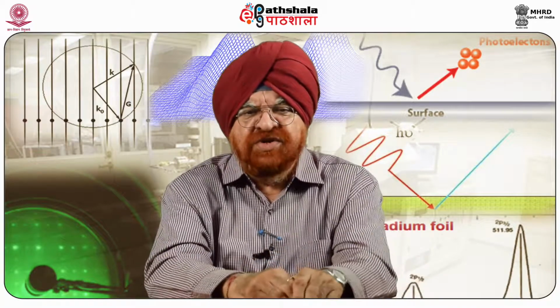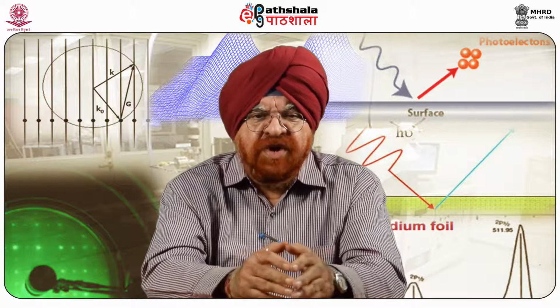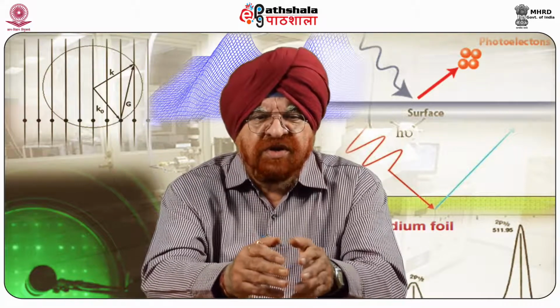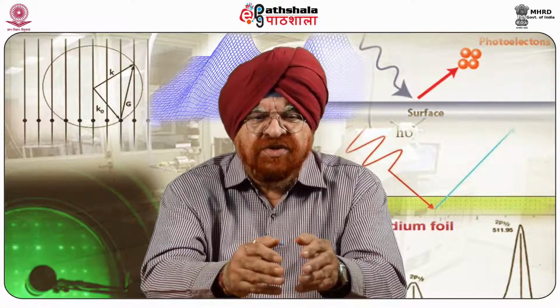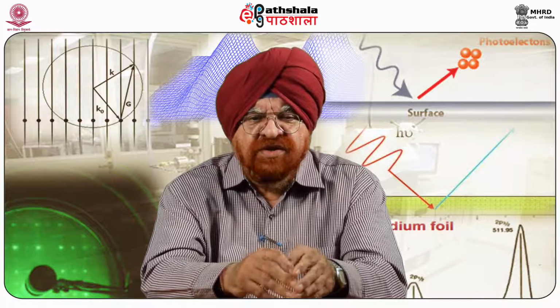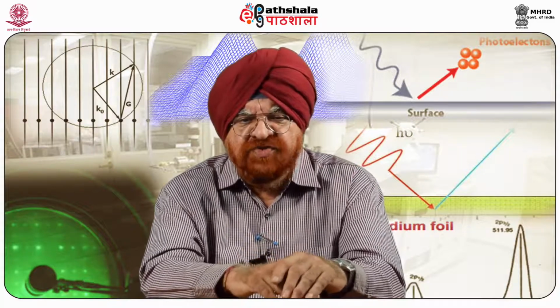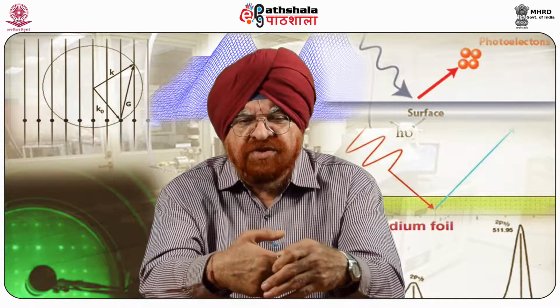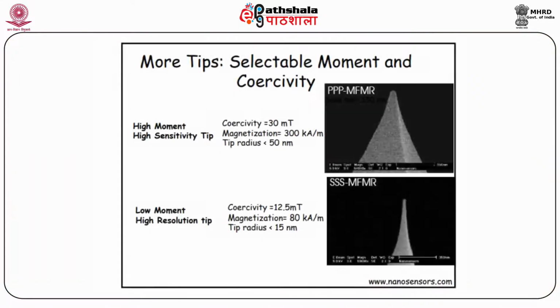In the present chapter, we will also demonstrate some applications of the technique made by our research group in the study of magnetic vortex formation in sub-micro-sized structures, as well as further magnetic properties of silicon and germanium-based magnetic semiconductor thin films.